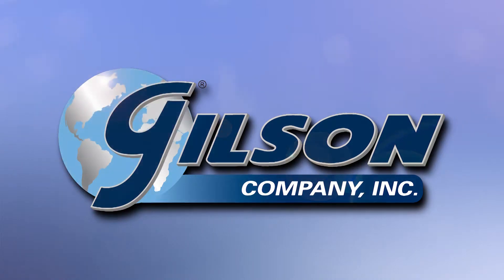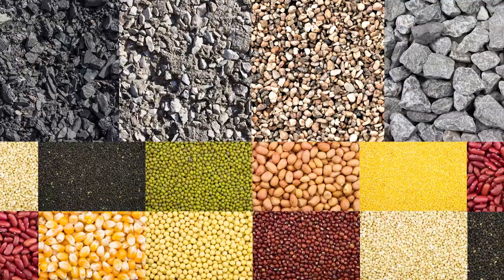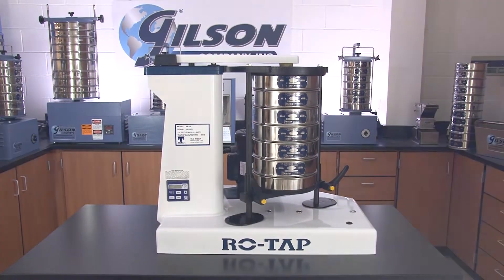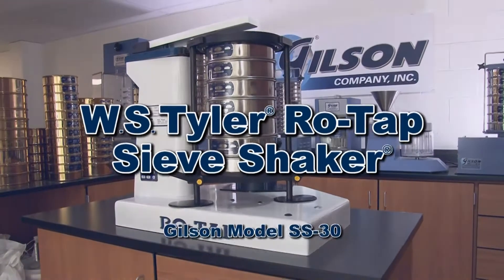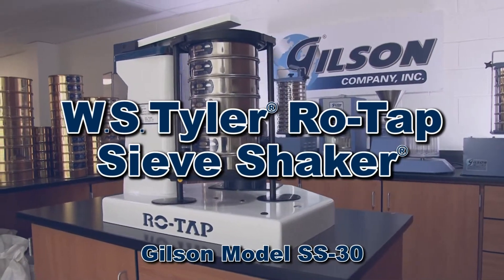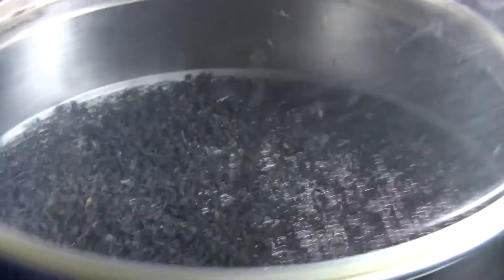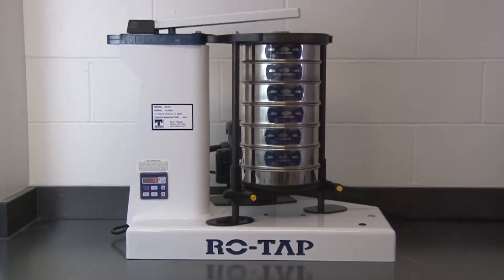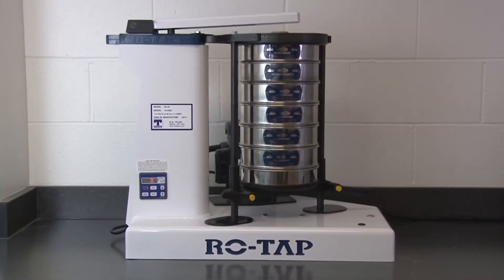When you need accurate sieve analysis of a broad range of particle sizes and material types, Gilson is your best choice for sieve shakers. The W.S. Tyler RowTap 8-inch sieve shaker has a unique circular motion that continuously reorients particles on the sieve mesh and vertical tapping action at 150 taps per minute that assist in passing near-size particles to clear the mesh.